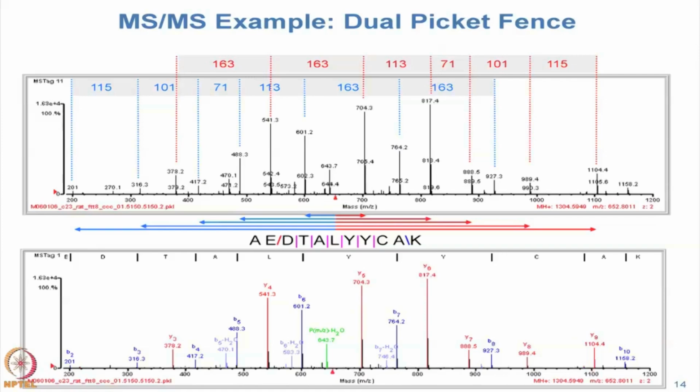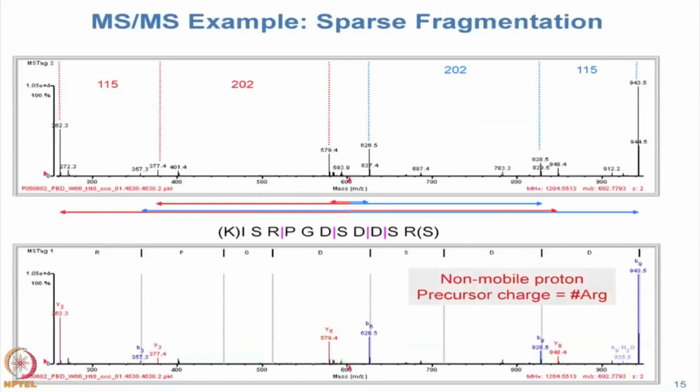Okay. All right, but as with mass spectra or driving down the street in India, not all two-wheelers are Royal Enfields, okay, sadly. All right. So you get peptides that will fall apart to not give anywhere near as complete sequence information. And it's actually much easier to manually interpret these things because you can't get very far, okay?